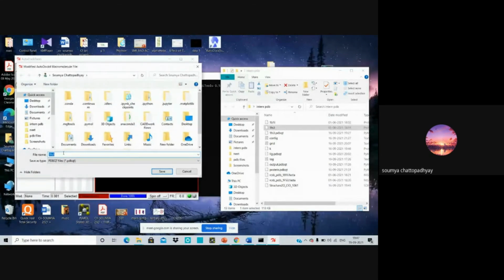After you have the PDB file, there's another type of file, the PDBQT file. For the docking, you need that PDBQT file. I saved this file before as protein PDBQT. I'm not going to save it again, but this is how you prepare a protein for docking.